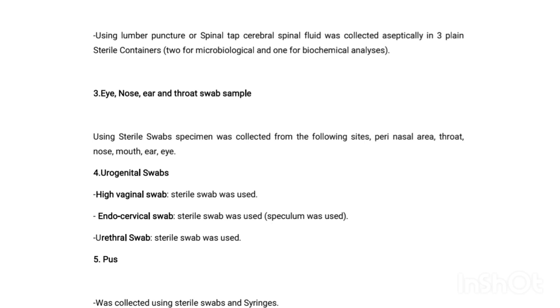When collecting the cerebrospinal fluid, we use 3 containers, meaning we need to collect enough, because collecting the sample from the spinal cord is very painful.